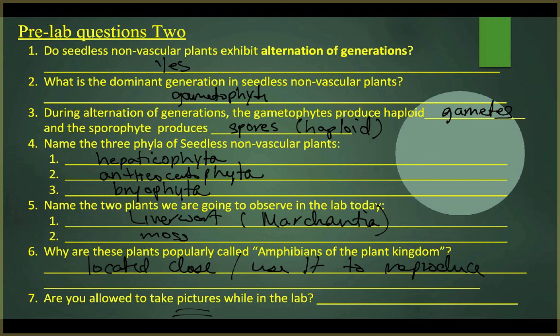You can just take it with your phone. Now, with this, they've taken them for you, right? It makes it hard because if you were looking under there and taking pictures, you would have a bit of a reference, but you get to miss one of the steps here. But I'm just telling you this because it can make you extremely successful.